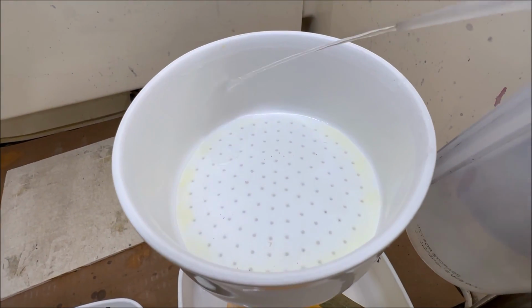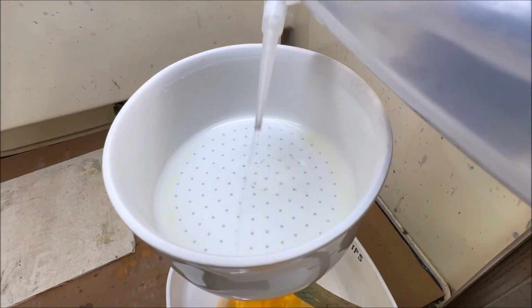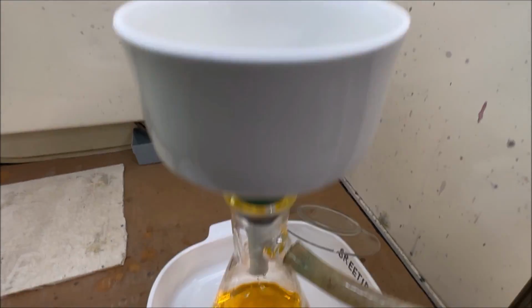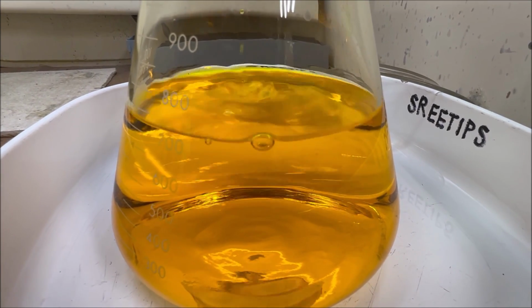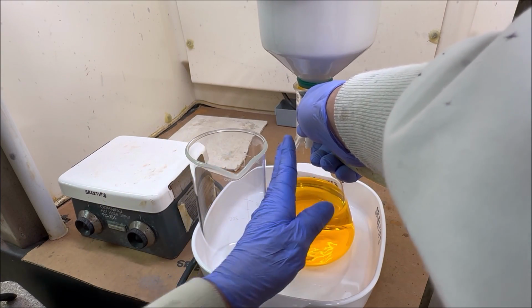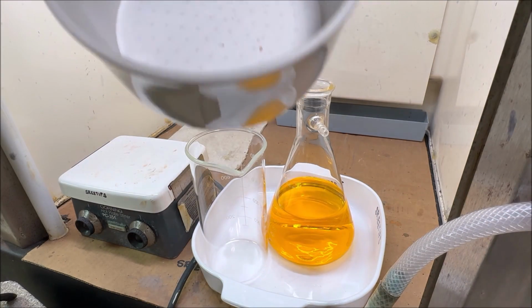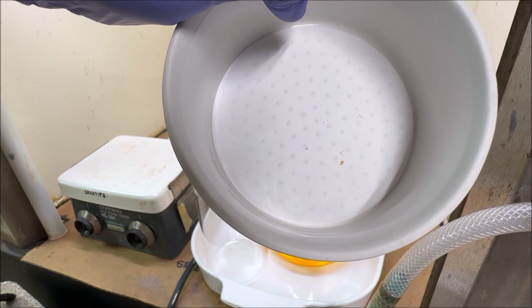Here's what's left in the filter. Essentially nothing. Just a few tiny crumbs of gold that didn't dissolve. And if you look at our solution down here, crystal clear. Looks perfect. Let's take our filter off of here. Here's what we have in the filter. A few tiny pieces of gold. Nothing else.